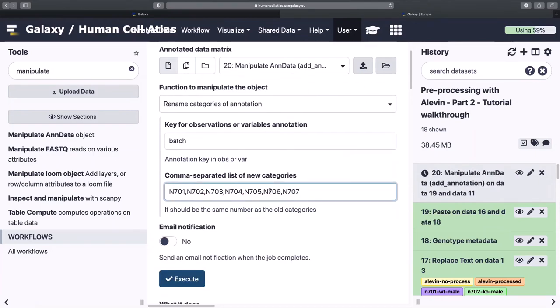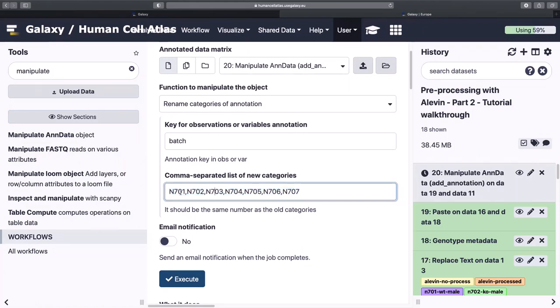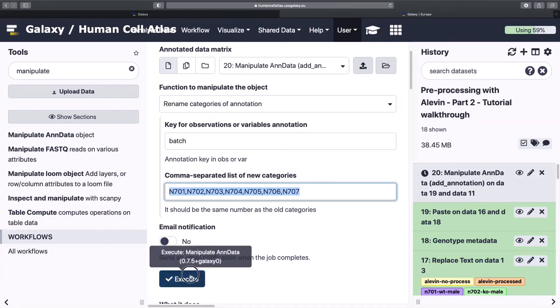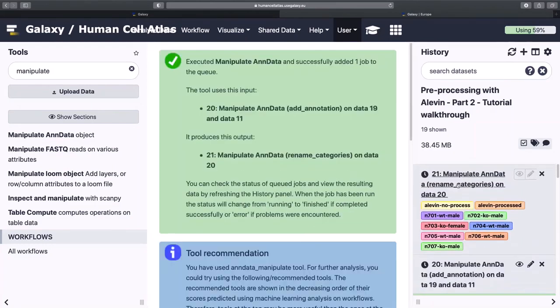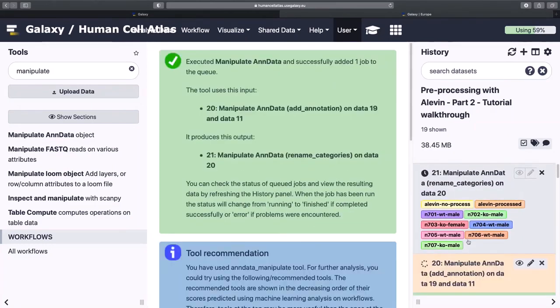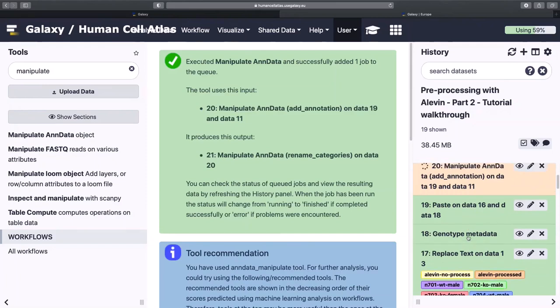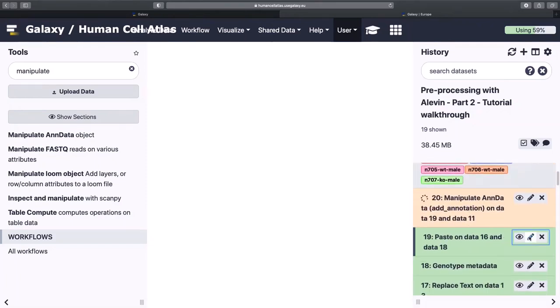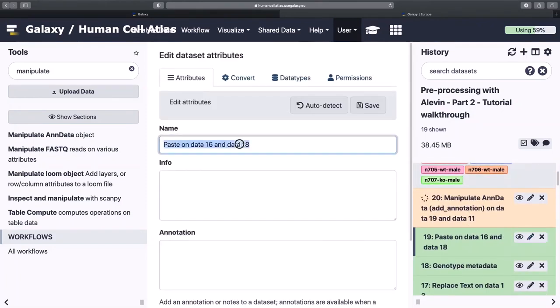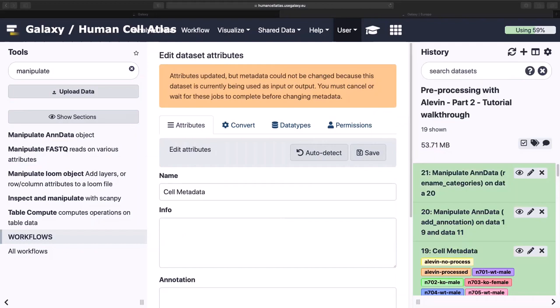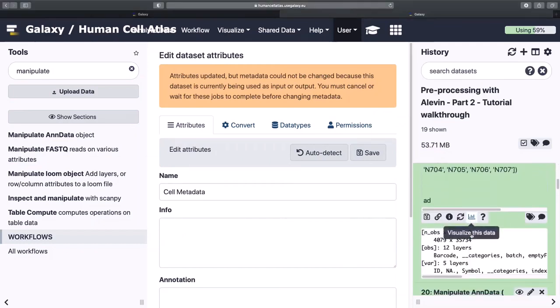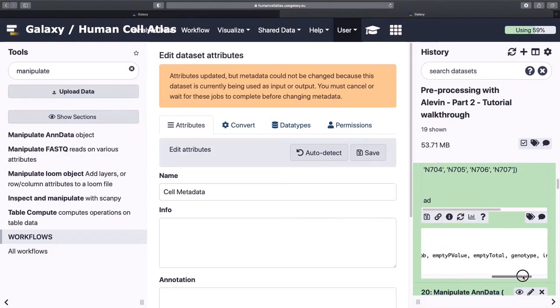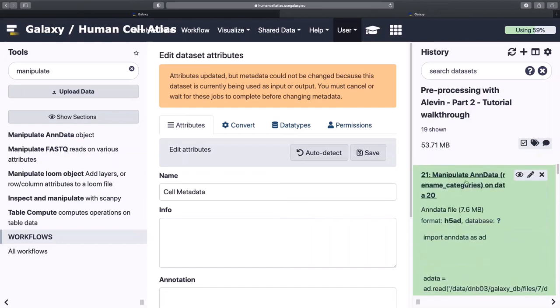And I've seen people fail here because if you get to this step and it doesn't work, it's often because you didn't actually concatenate all of the datasets in that very first concatenate step. So if this one fails for you, check that and make sure you didn't accidentally add like one dataset twice or missed off a dataset. And we're so, so close. Got all of our lovely data. Now we have genotype and sex are in our observations or cells information.